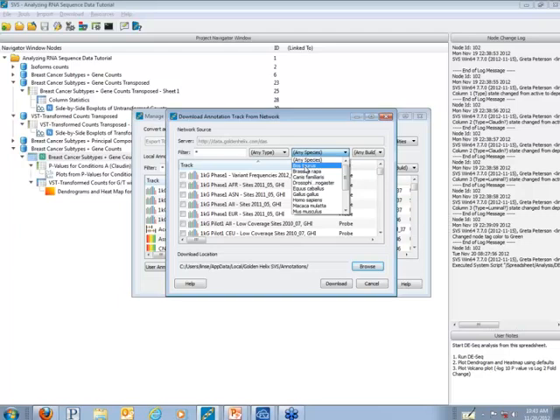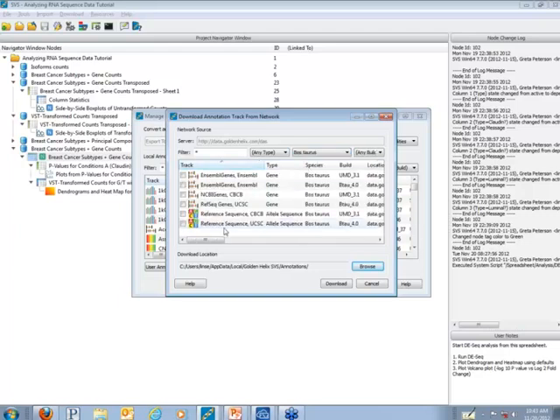For instance, for Bos taurus, we have 2 reference sequence tracks, the CBCB or UMD 3.1 track and the older Baylor BTAU4 track. We're continuously updating and adding more reference sequence tracks. So if you do not see the species that you are working with, please contact us and we will add it to our list of species that we're curating data for.